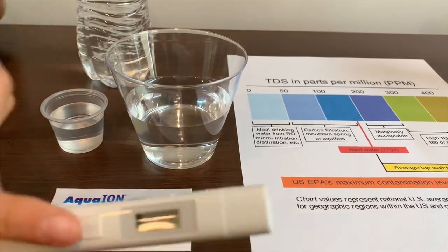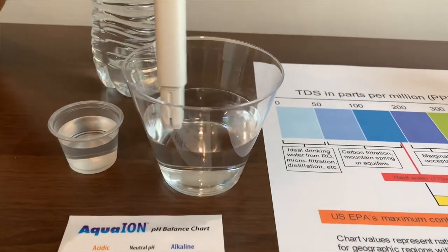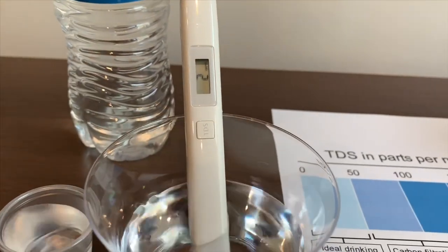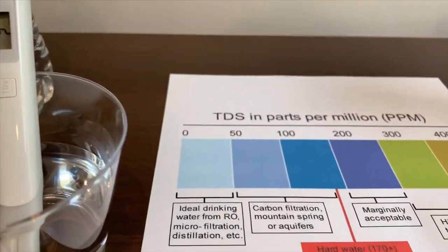Let's put on the TDS tester and put it in. It says 2 — that is ideal drinking water.